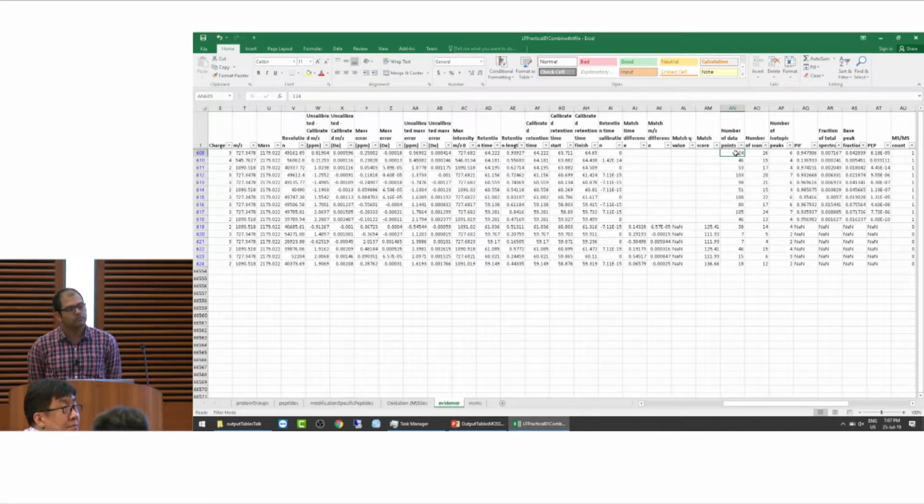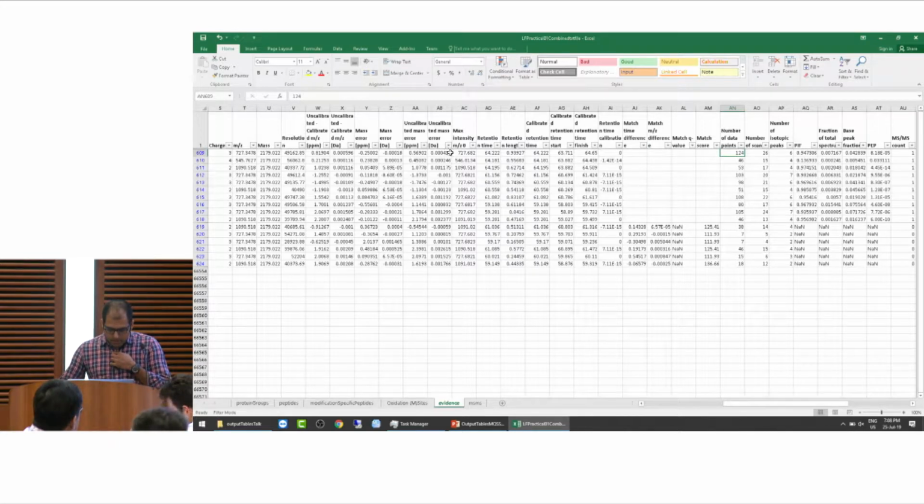But how about, say I have an N of 5 for each group, and I want to make sure that it's in 3 of 5, maybe at least for one group, and see a change somehow? Yeah, you can. That's also a perfectly valid thing to do. But if you're really looking at whether that protein is first of all correct, and you're really suspicious, you can even look at the mass error. So the mass error is 0.2. Not so great, not so bad.